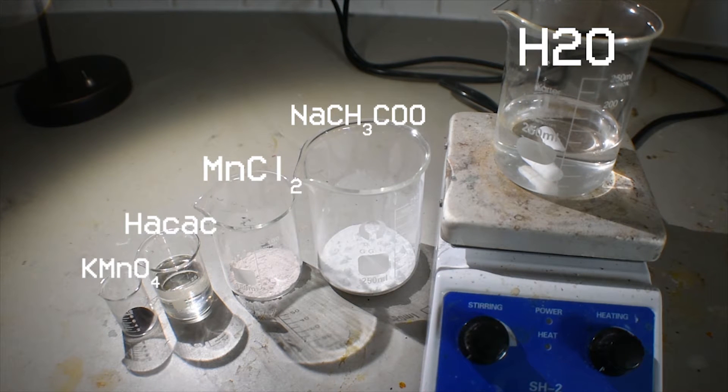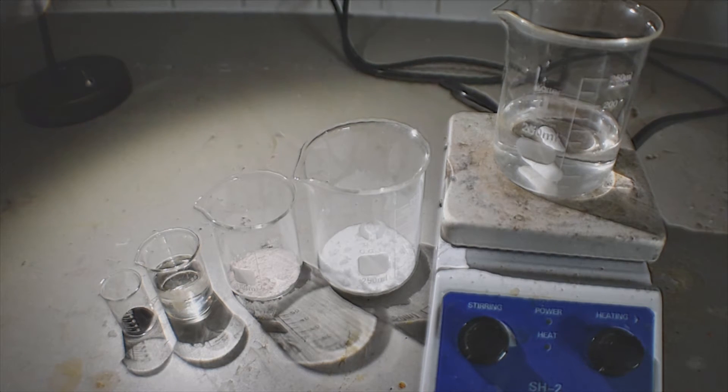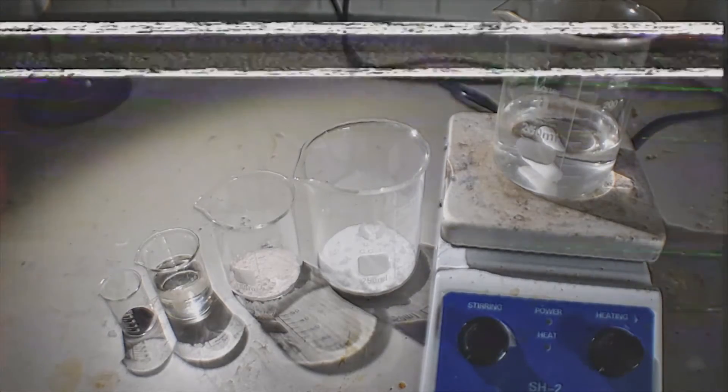You will also need two successive portions of 25 and another 25 mL of distilled water to dissolve the reagents. Since I am doubling this synthesis, you will actually need two portions of 50 mL of water, not 25.